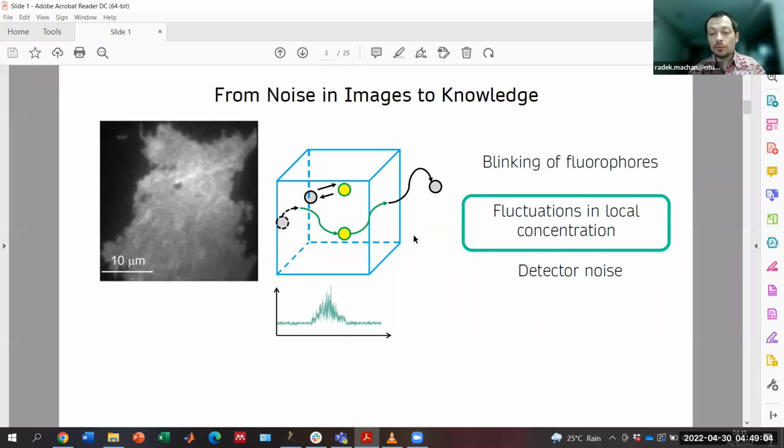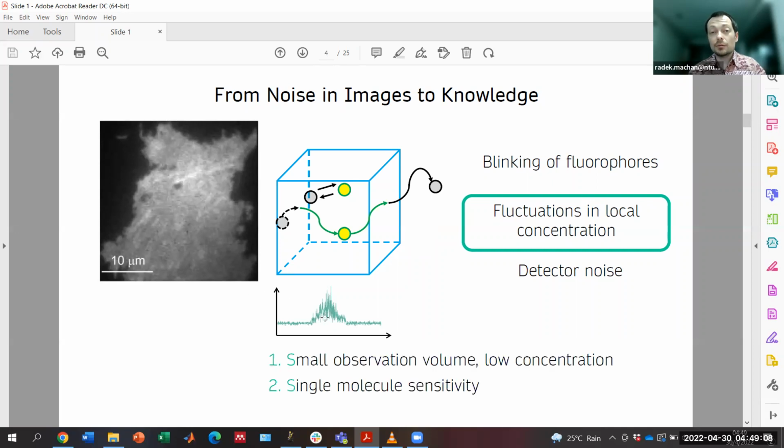So how do we measure the duration of this burst? In fluorescence correlation spectroscopy, we do it obviously by correlations. But let's get to what is required to perform this type of analysis.